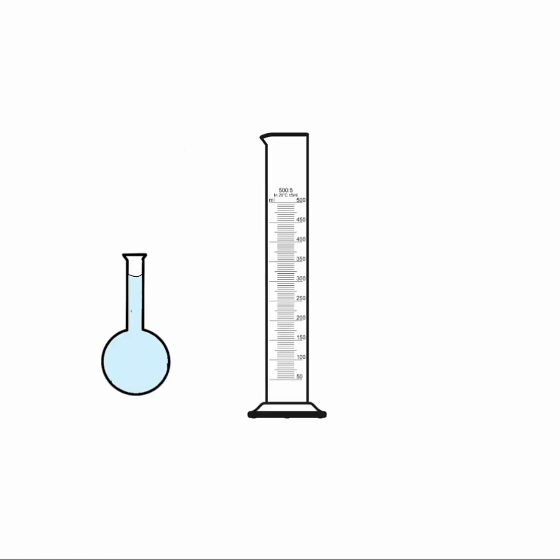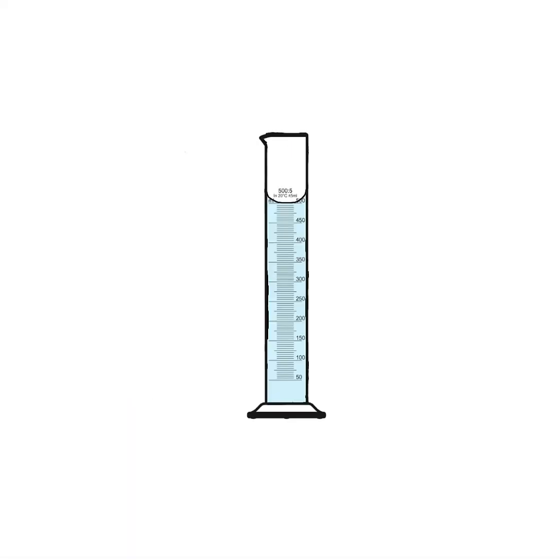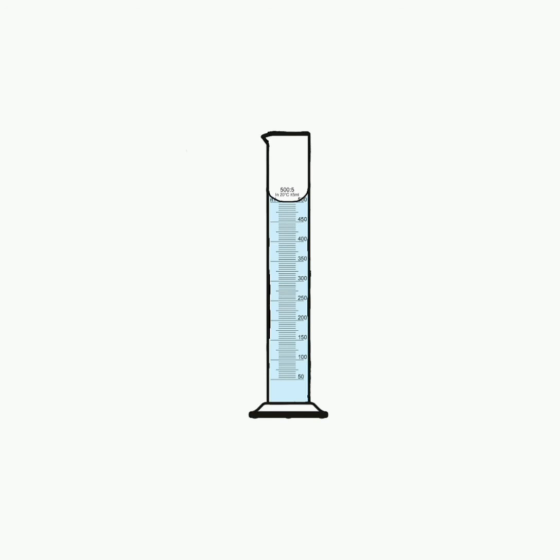Now let's measure out the required 500 milliliters of the solution. There we go, 500 milliliters of 0.01 molar sodium hydroxide solution.